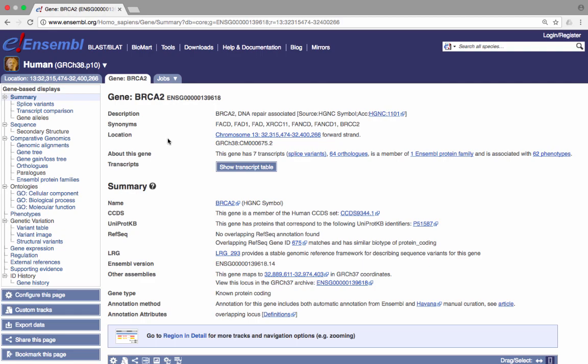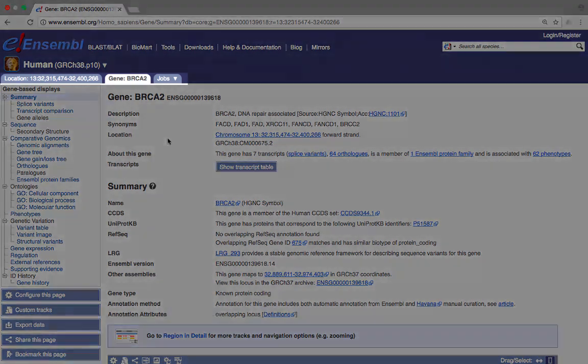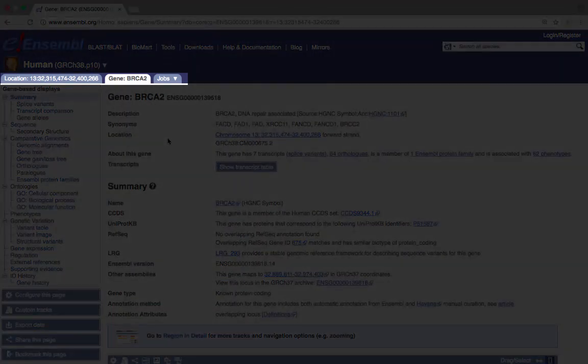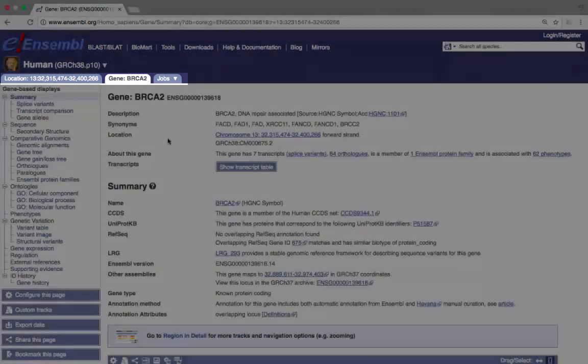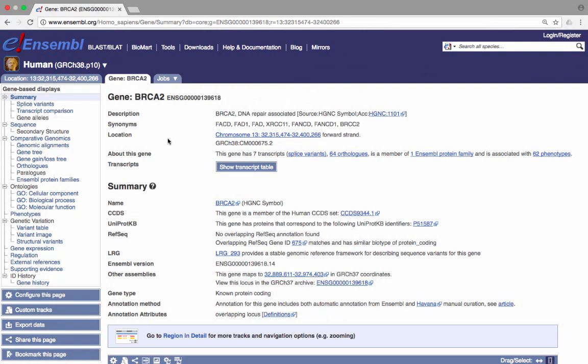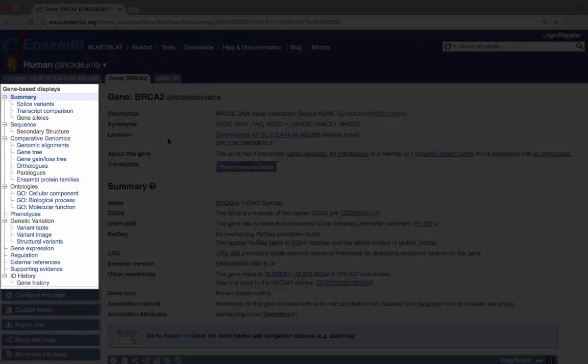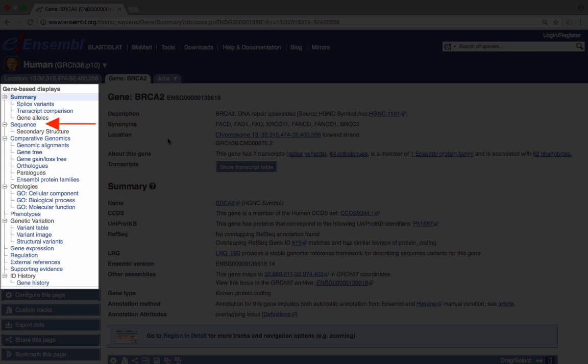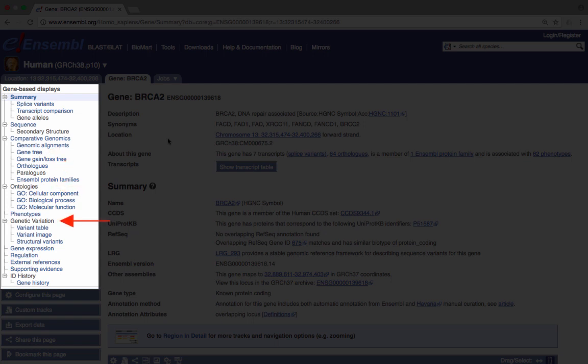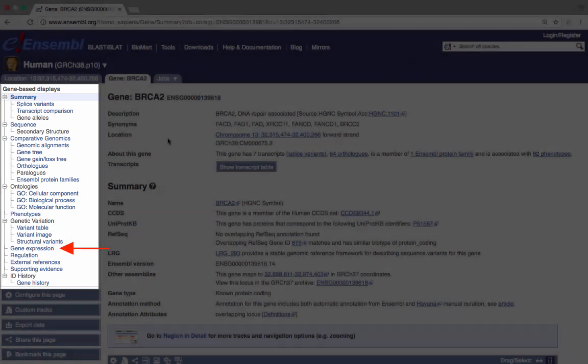The Ensembl views are separated into tabs. At the moment, we are in the Gene tab. Links on the left show specific information for the BRCA2 gene. For example, genomic sequence, sequence alignments, the BRCA2 gene tree, homology relationship, gene ontologies, variation data, and BRCA2 gene expression.